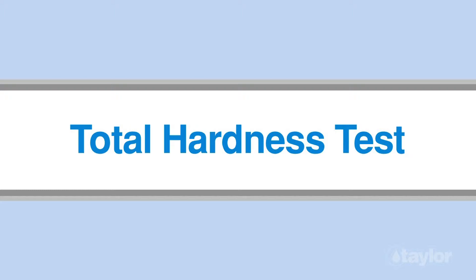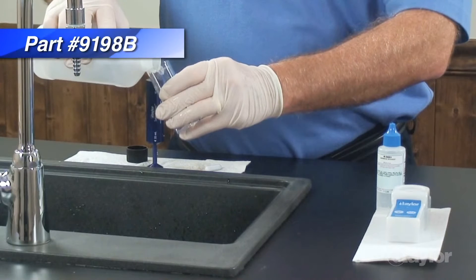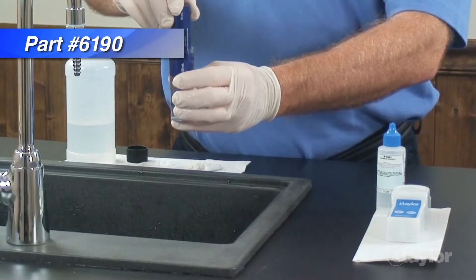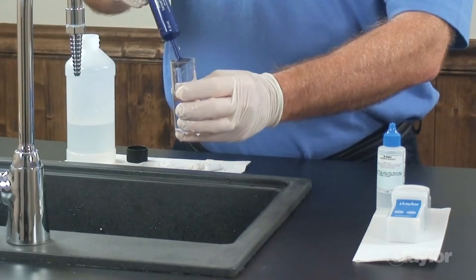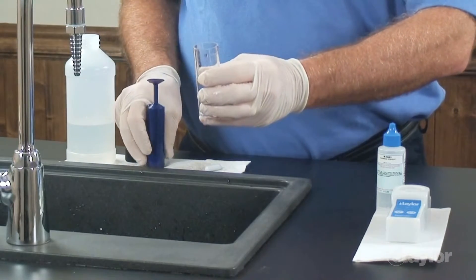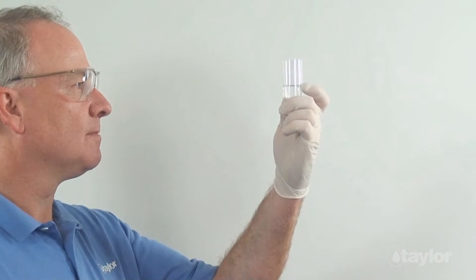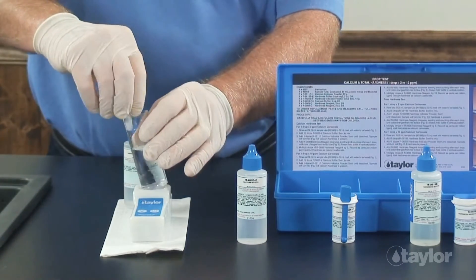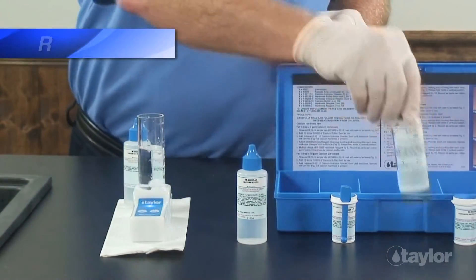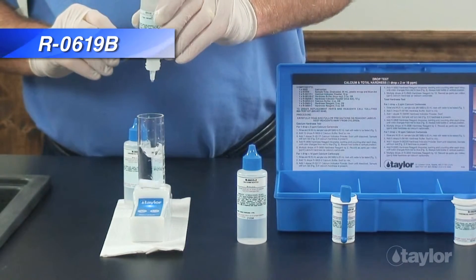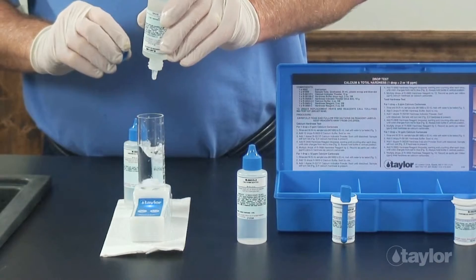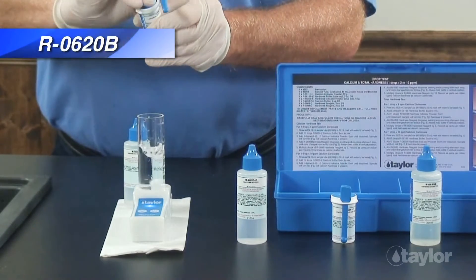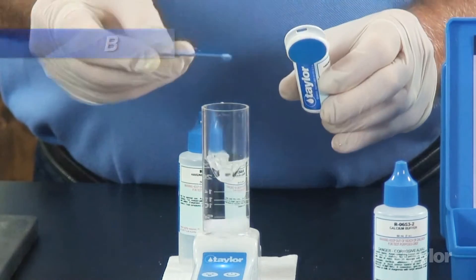Next we will perform the total hardness test. Fill the sample tube to the 25 ml mark with the water to be tested. Add five drops of hardness buffer and one level dipper of hardness indicator powder and swirl to mix. If hardness is present, the sample will turn red.